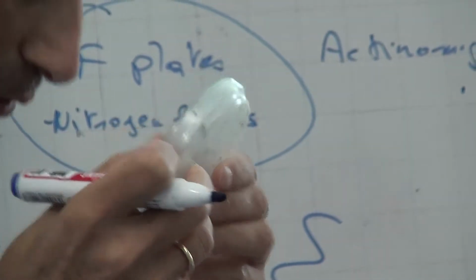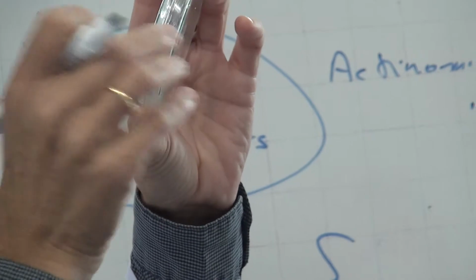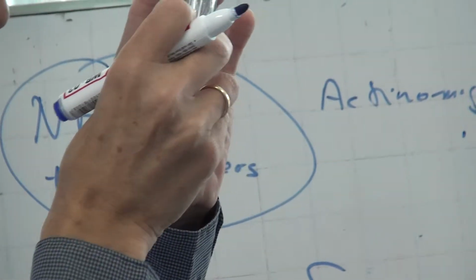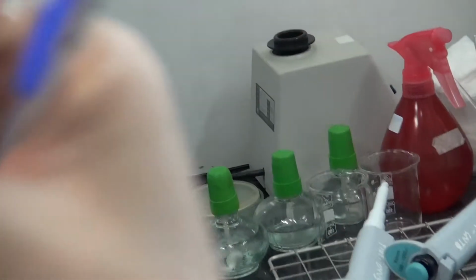Yeah, and even if you look here, there is nothing really. Or maybe here around the trunk, you see something brownish. So you can look, and so you can know what you're looking for. But you don't have to count them. Just get the impression. It's not difficult to isolate them.